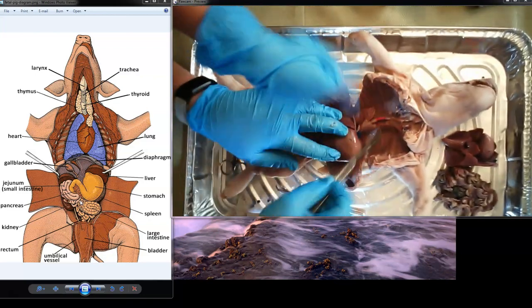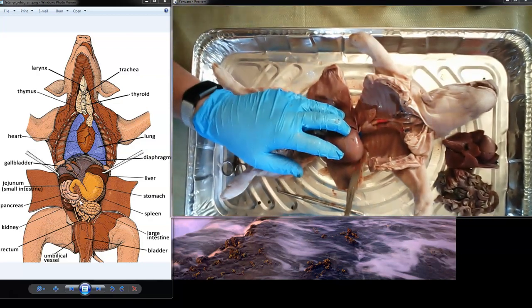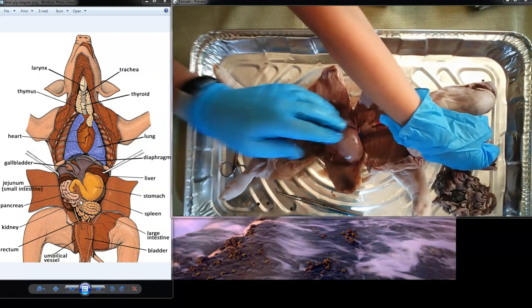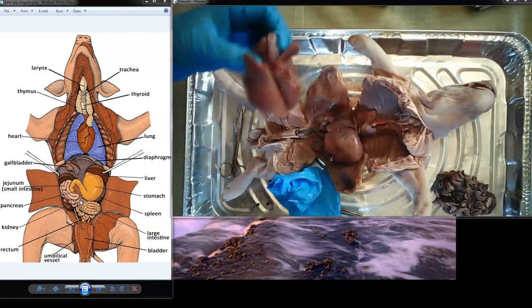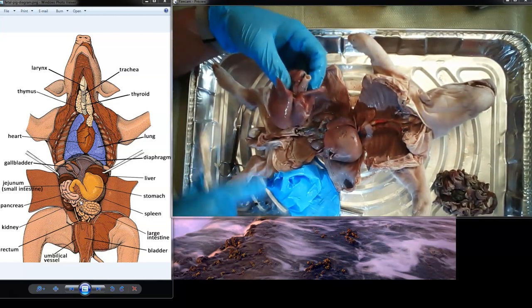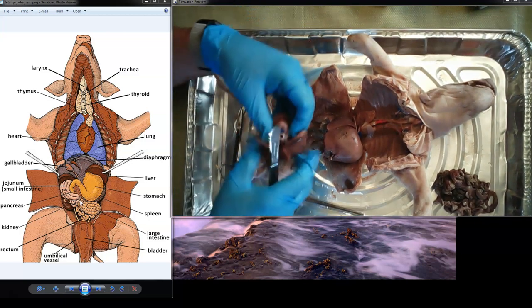The lungs are out. This is where the lungs were. The lungs are here now. I don't want to touch it anymore. So that's the heart. Sure, you can take your glove off and go throw it in the garbage right there. That thing right there is the heart. Uh-oh, that's okay. Pick it up. Go ahead. This is the inside of the glove. Touch this part. Okay, go ahead. Throw it in the garbage.